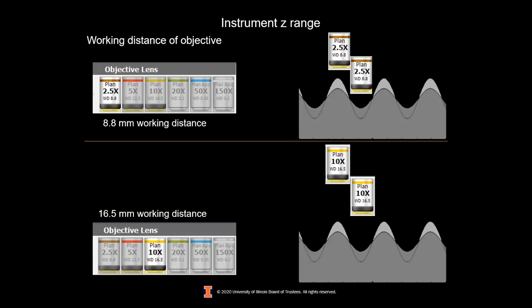The other ones didn't. I'm pretty sure Olympus could maybe adapt something to there. I know that Keyence has a fluorescence microscope as well, but it's a different fluorescence microscope. It's not Confocal as far as I know. I need to check again on their website. But I don't remember. Ours don't have a fluorescence or Raman on it, so we cannot do the same there.